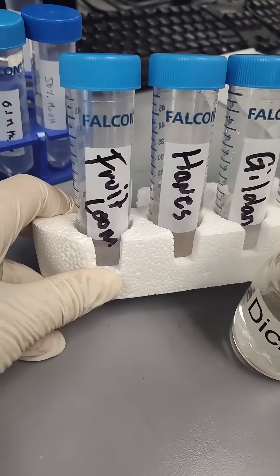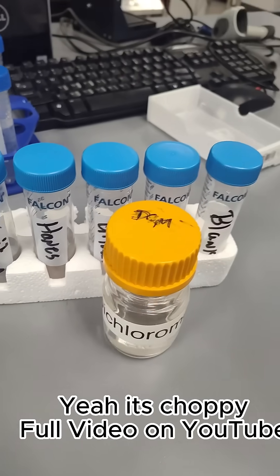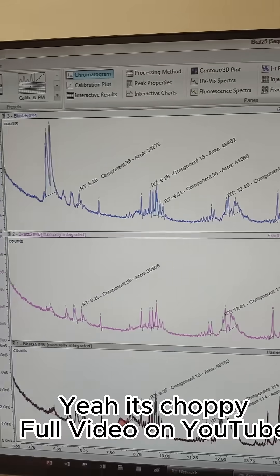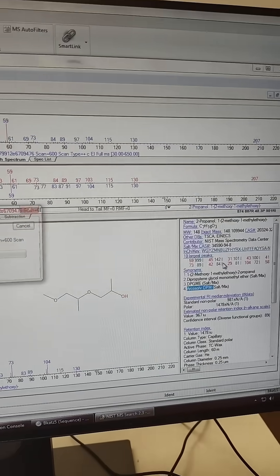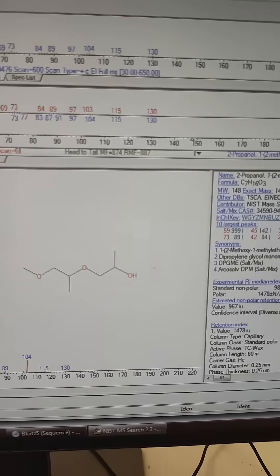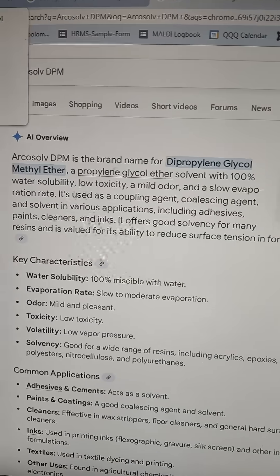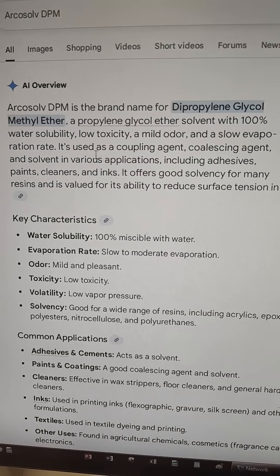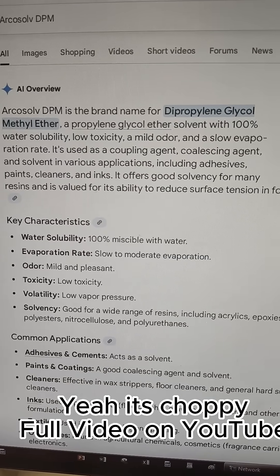DCM liquid-liquid extract - all the t-shirt water extracts went into the GC-MS, and we ran them. In the Gildan specifically there's a cluster of peaks which we can identify. Sending these to NIST, it is this ether or Arcosolv DPM, and then this looks like it could be a solvent. So it seems they're using a solvent to dye or do something with the fabric and then not removing it - just in the Gildan.